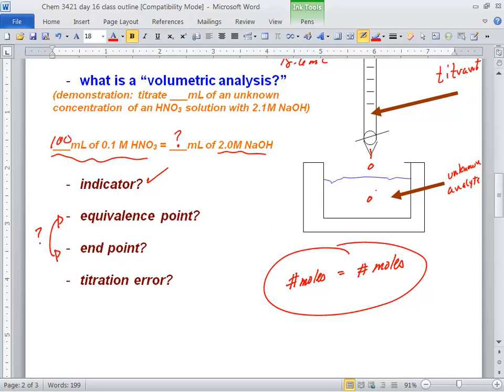So that's what titration error is. A lot of it is just you could pick the wrong indicator. But not only that, I think a more direct titration error is I had to add some phenolphthalein in here. NaOH is in the burette. Well, NaOH has to react with the phenolphthalein. Otherwise, it's not going to change colors on you, because that's all it does. It just has different colors, whether it's acidic or basic. Its conjugate acid and conjugate base are different colors.